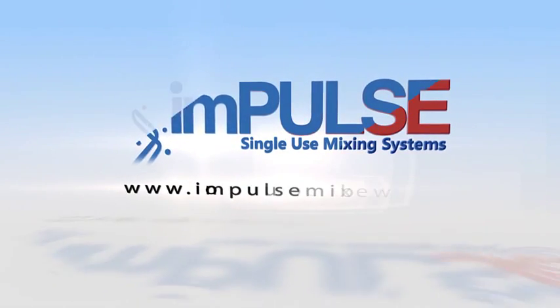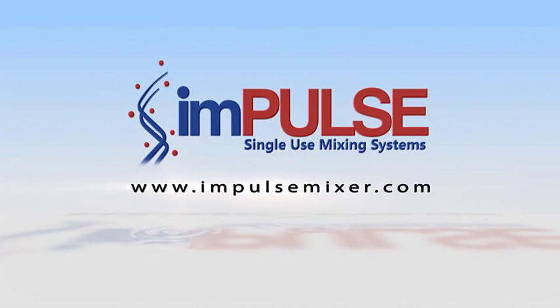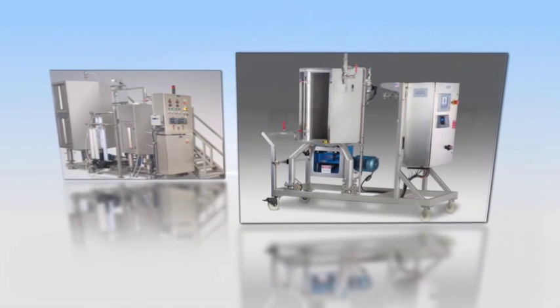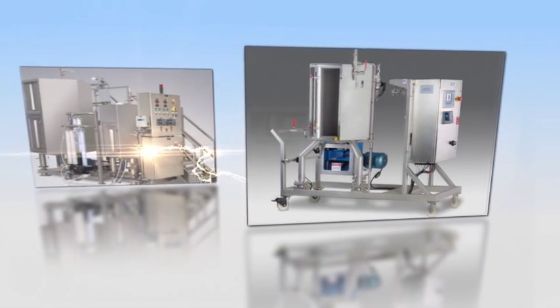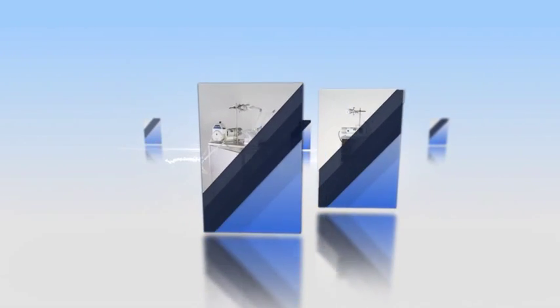Impulse single-use mixing systems are designed to mix solutions of powder and liquid, or liquid and liquid, efficiently at agitation speeds from mild to aggressive. These systems eliminate the need for clean-in-place processes and prevent any cross-contamination while reducing cycle times and improving efficiency.